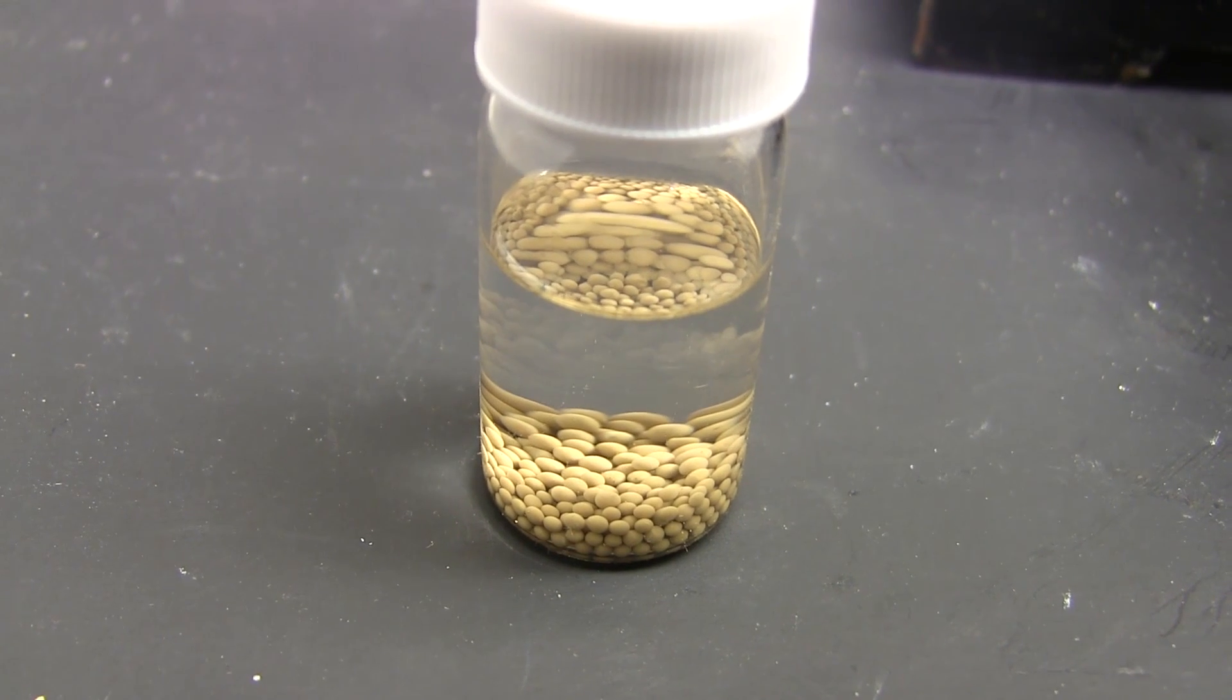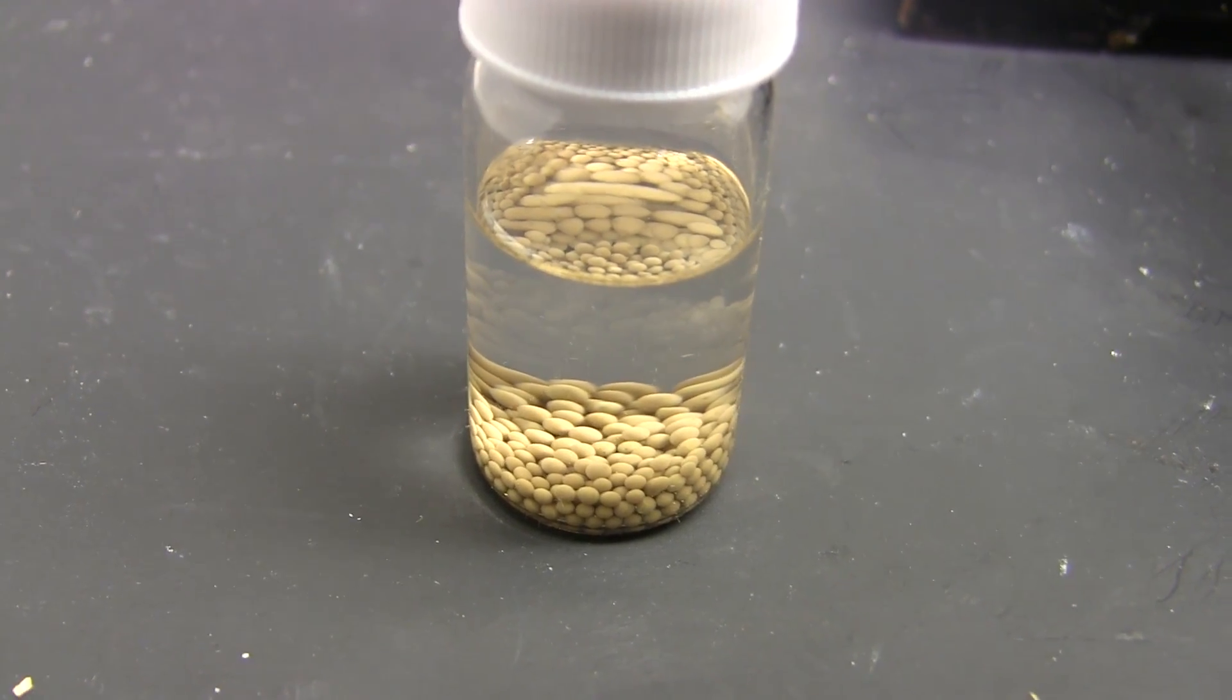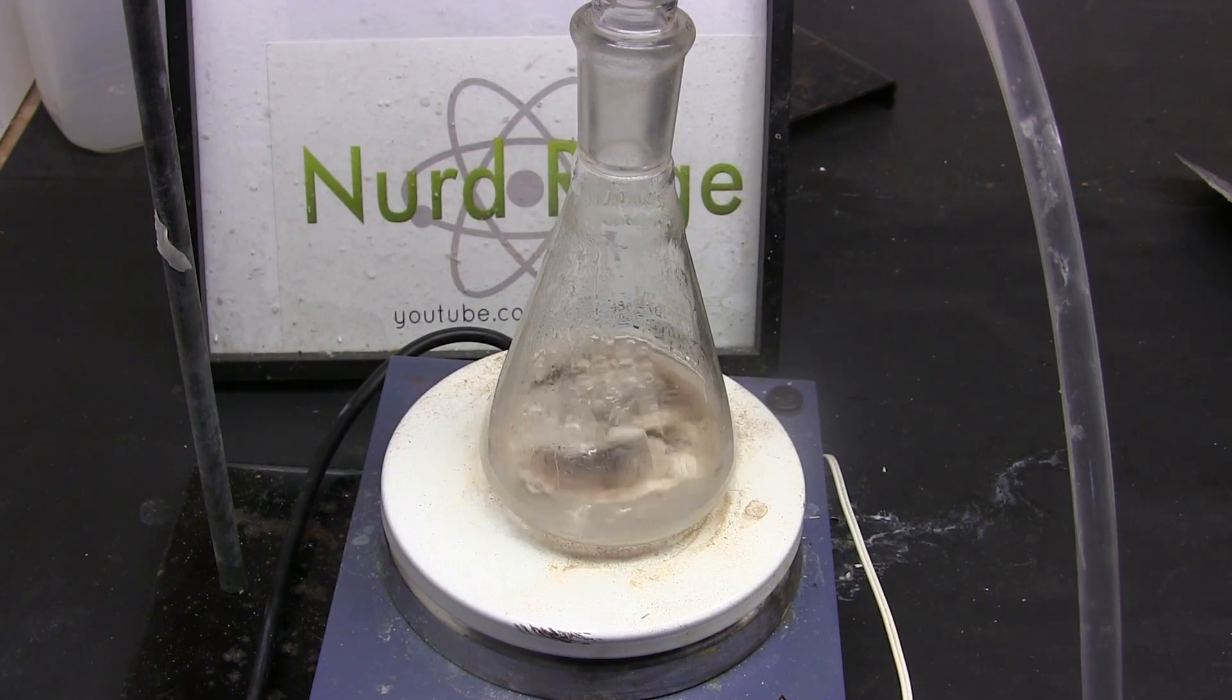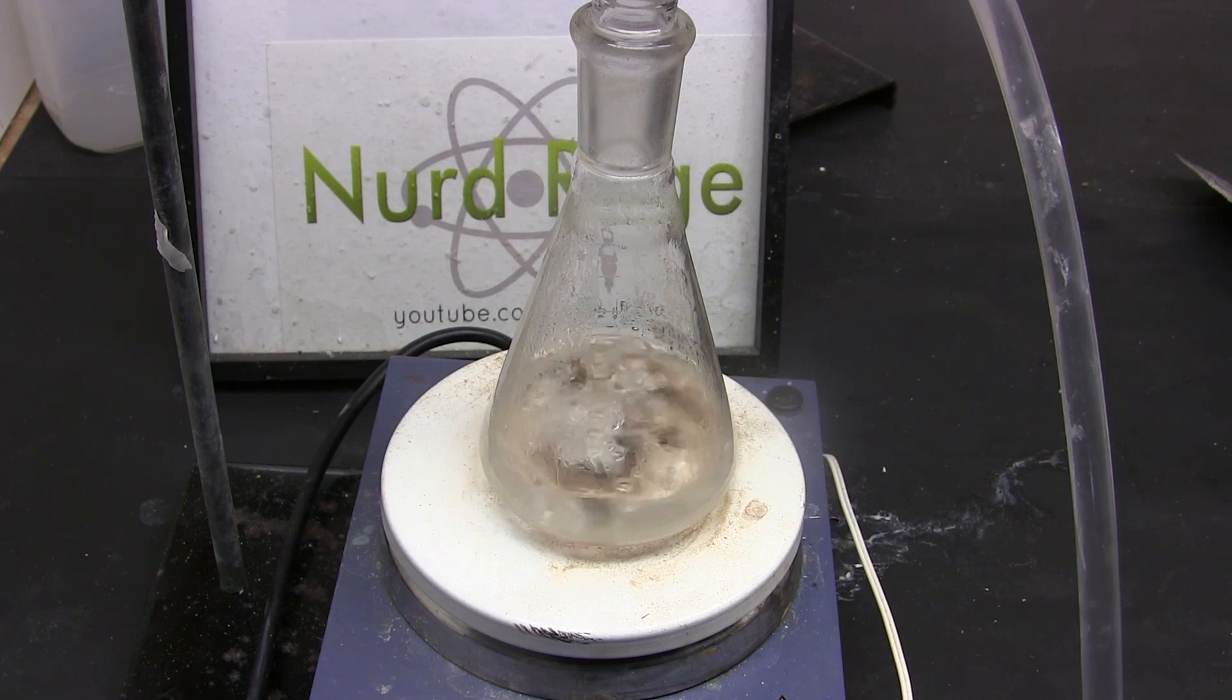Greetings fellow nerds. In this video we are going to make ethylpropionate ester by the classic process of Fischer esterification between ethanol and propionic acid.